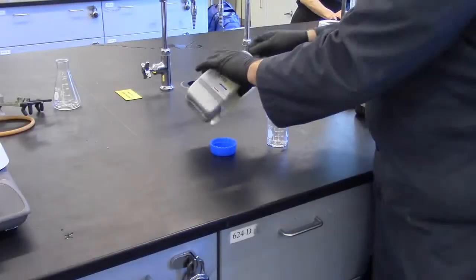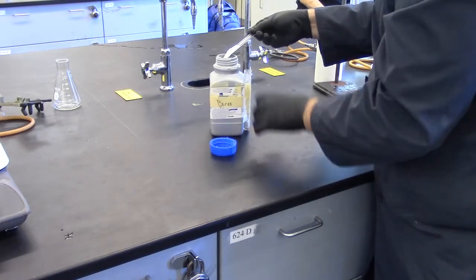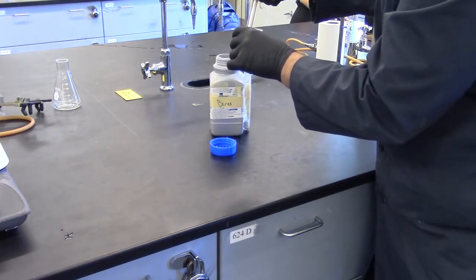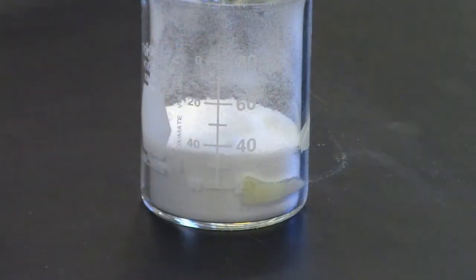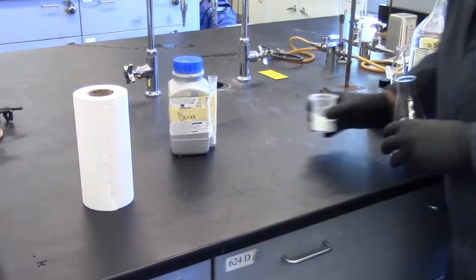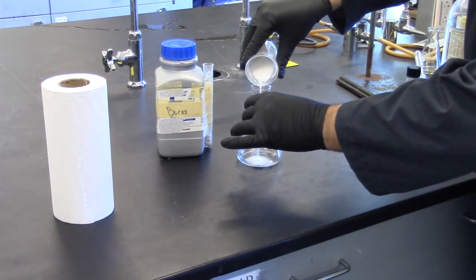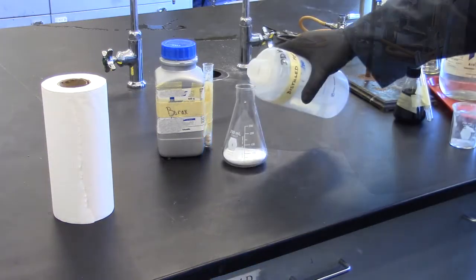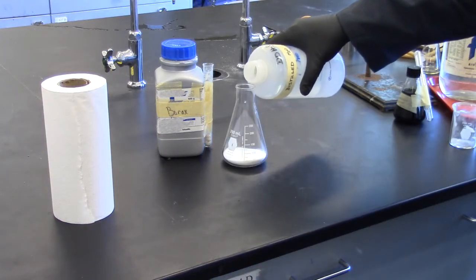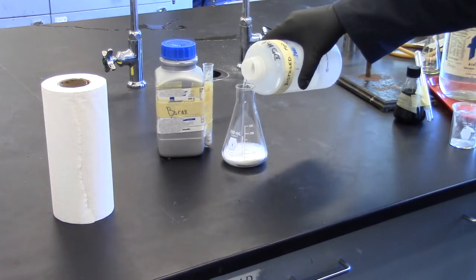The first step does not require weighing. Obtain a sample of solid borax and put it in a small 100 milliliter beaker. Fill it up to the 40 milliliter mark. Transfer borax into a 250 milliliter Erlenmeyer flask. Add approximately 80 mils of distilled water to this.